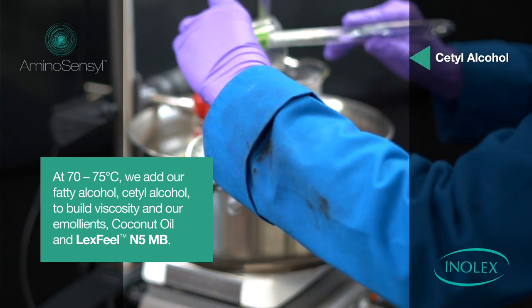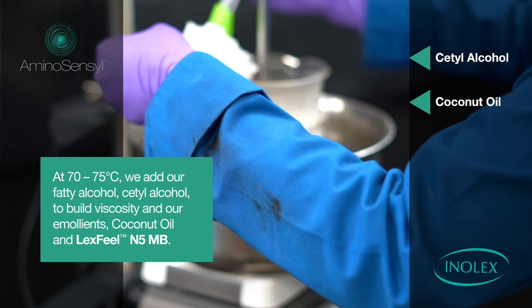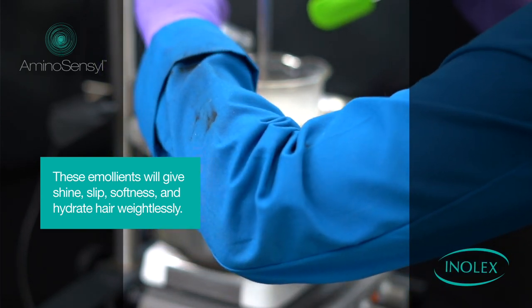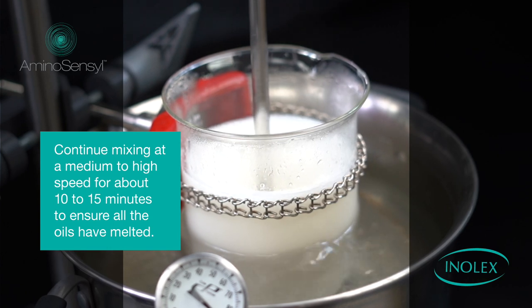At 70 to 75 degrees Celsius, we add our fatty alcohol, Cetyl alcohol, to build viscosity, and our emollients — coconut oil and Lexfeel 5MB. These emollients will give shine, slip, softness, and hydrate hair weightlessly. Continue mixing at a medium to high speed for about 10 to 15 minutes to ensure all oils have melted.